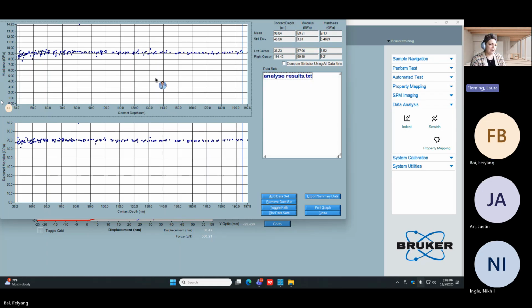Then on the other end of the spectrum, I have what I affectionately call my concrete guys in Iowa who are testing on concrete, which is really rough on a probe, and they have to do a tip area function every single time they sit down with the instrument because the wear from the previous testing has changed that shape enough that it's important.